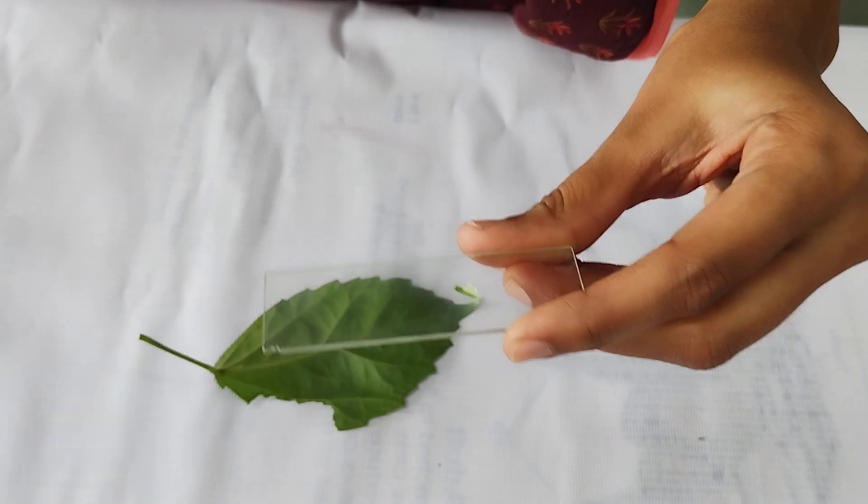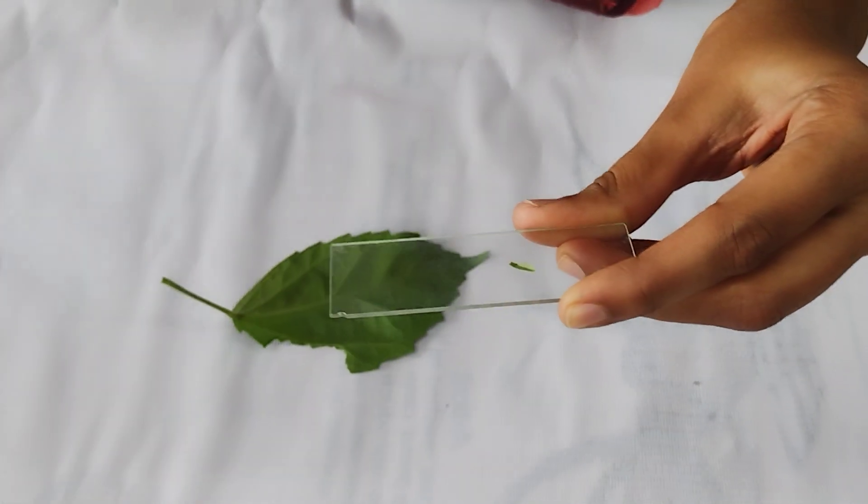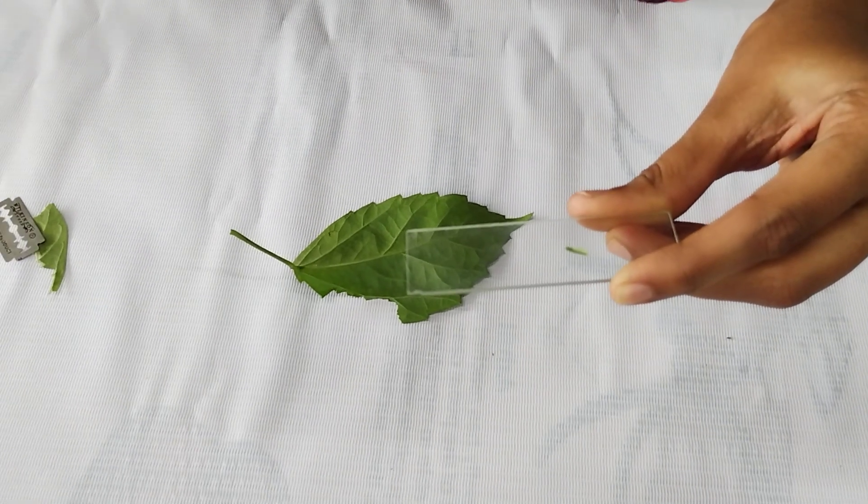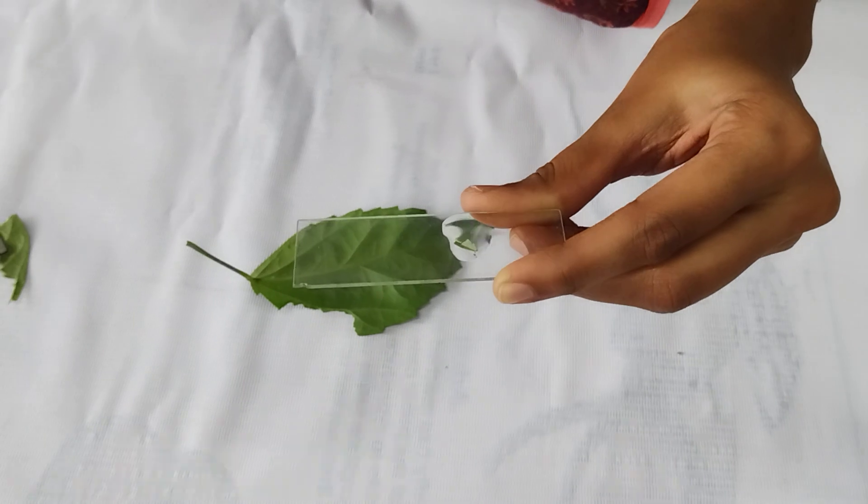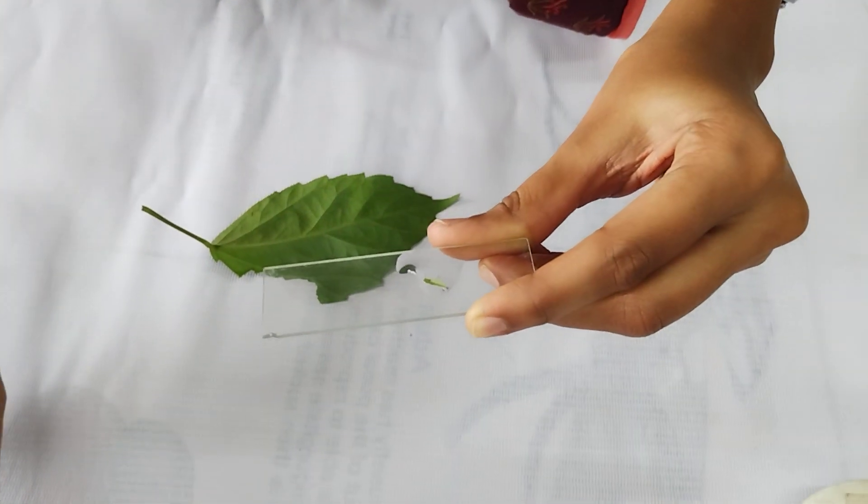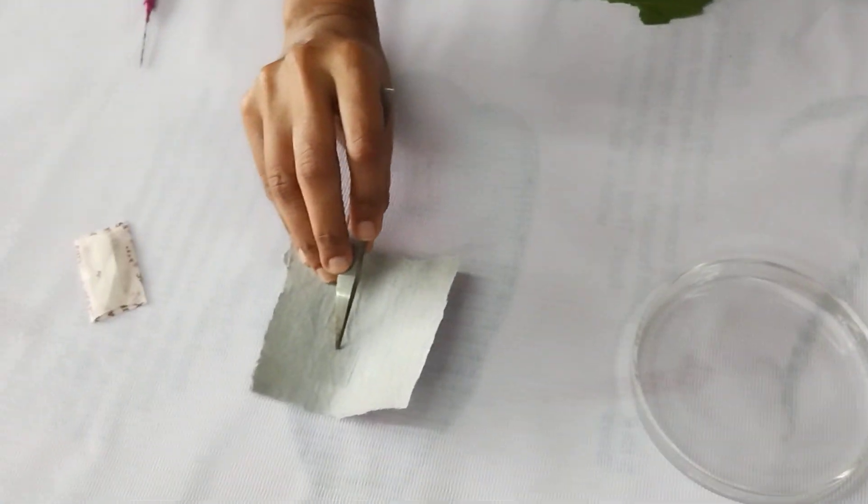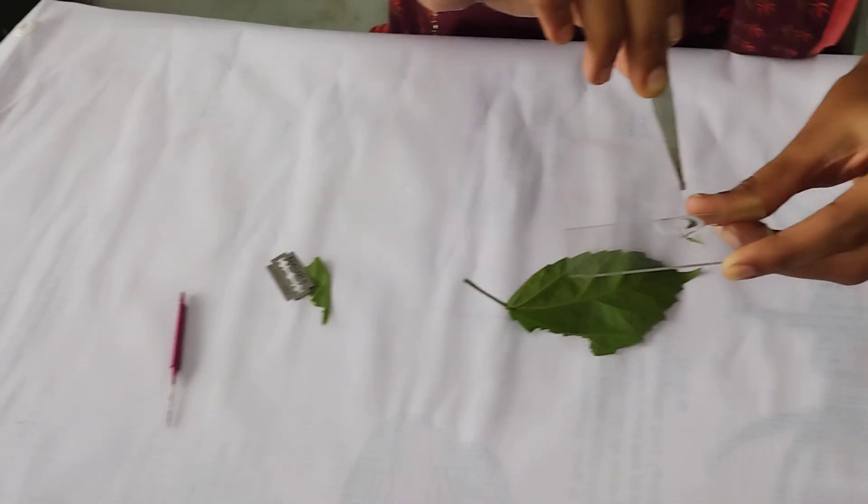Here we cut that white part, that is epidermis of the leaf. Then we are going to add a drop of distilled water on that part. After that, we have to place the cover slip on the slide.